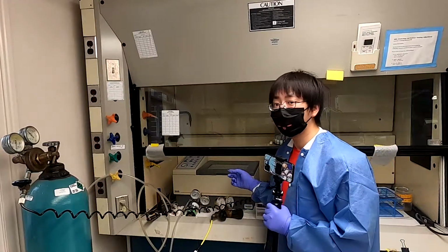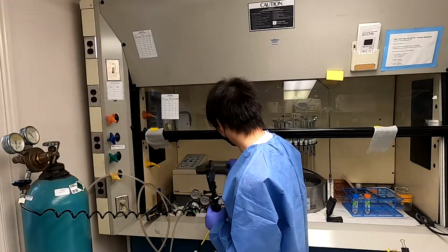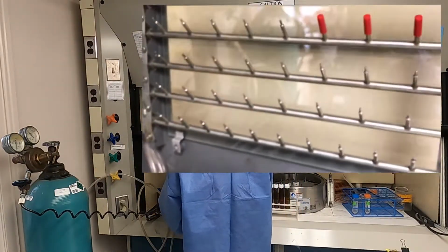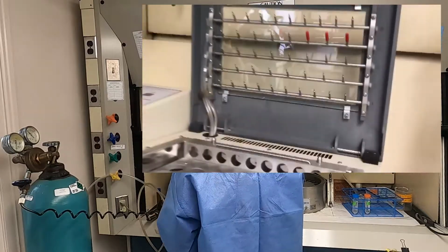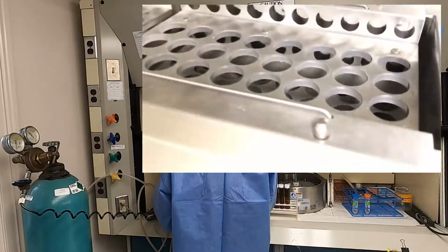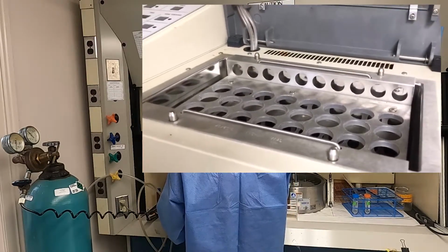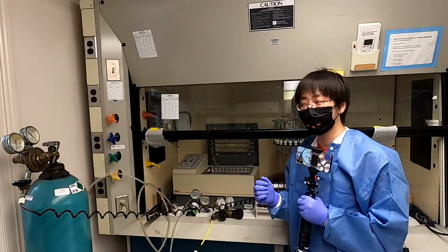And so this is the evaporator, and it is connected to nitrogen. So basically, we transfer our sample into the evaporator. And we can see that it has many needles, and these needles are connected to the nitrogen gas. So basically, these needles will blow the nitrogen to accelerate the evaporation process. And also, we can fill up some water in this container. So the water will heat up the temperature, and the evaporation process can be accelerated. And so we are going to transfer our sample into the evaporator.